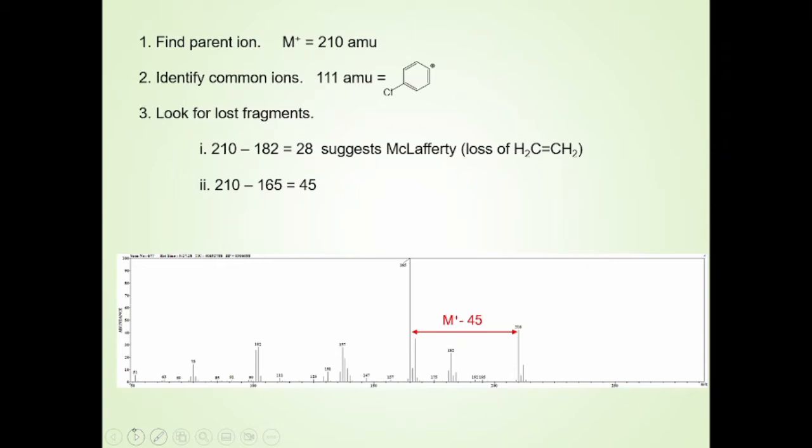So if you are trying to identify peaks, look first at drawing your structure, breaking the different bonds, and seeing what the masses are. If you can't identify it that way, then you might look at, well, what if I break this bond and this bond? What's the piece that we have? So double fragmentation should only be looked at when nothing else is giving you the mass you're looking at.